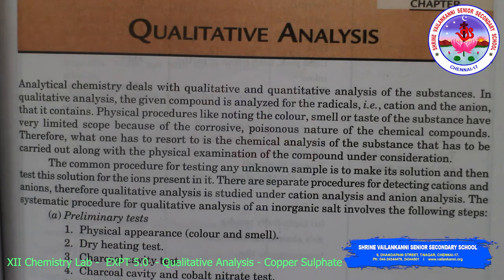For example, in hydrochloric acid, HCl, the chloride ion is the anion. In sulfuric acid, sulphate is an anion. Similarly, the basic radical is part of a base and is metallic in nature, and it is positively charged.